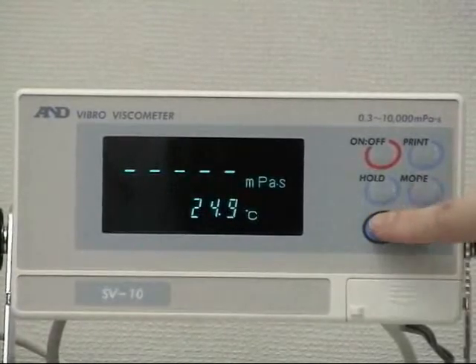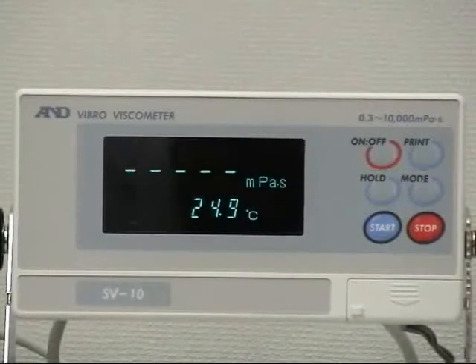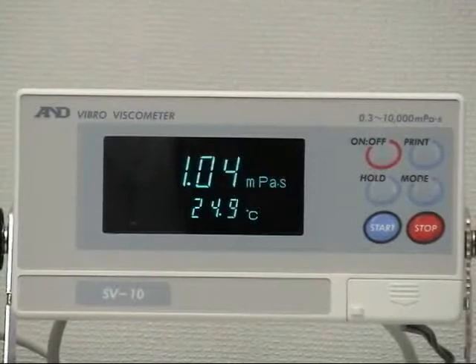Press the start key to begin the measurement. The processing indicator will start to blink. Fifteen seconds later, the viscosity measurement value is displayed. The viscosity and temperature measurements are on a real-time basis.